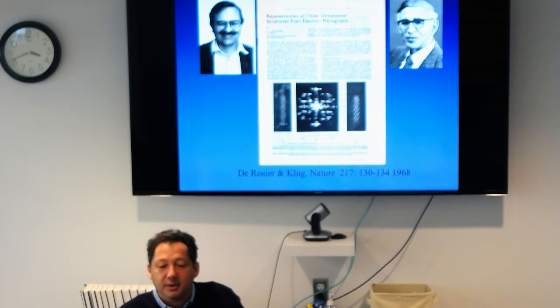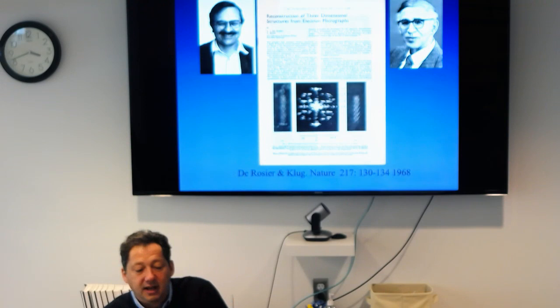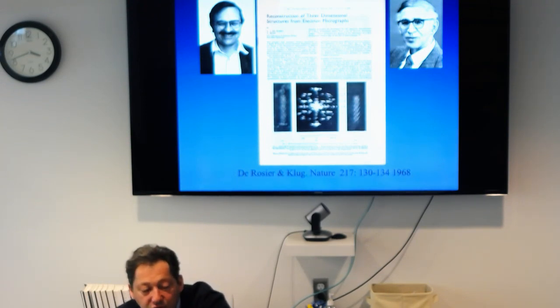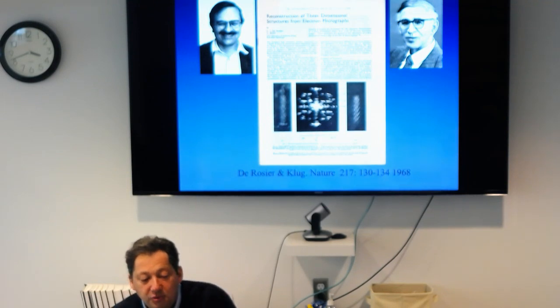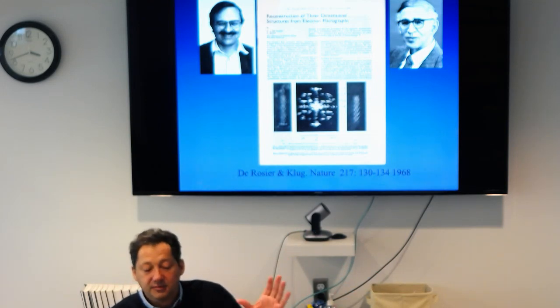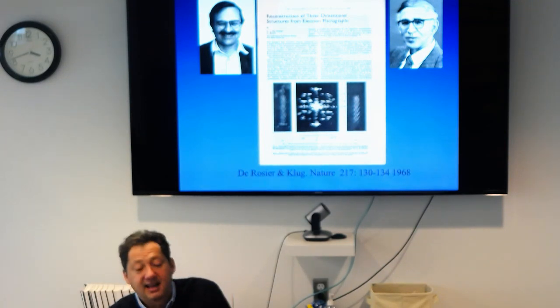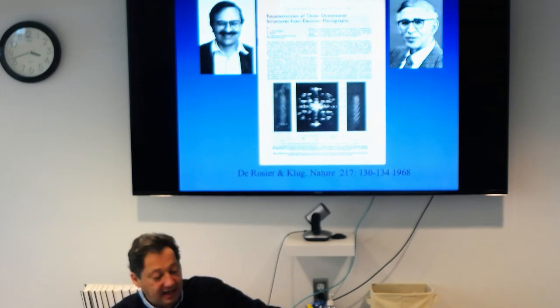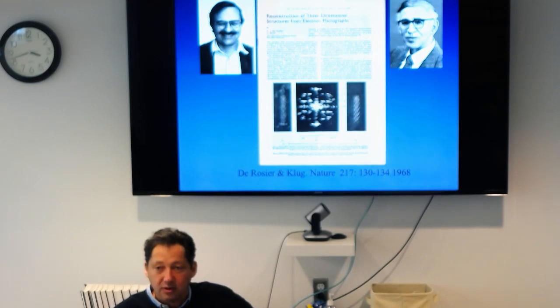That was realized by Aaron Klug and David DeRosier, and they used that to make a three-dimensional reconstruction of the tobacco mosaic virus that you see in 1968. And historically, EM initially was thought to only reach high resolution with very ordered specimens. And helical specimens have this particularly useful property of allowing you to get the full three-dimensional view in just one view.